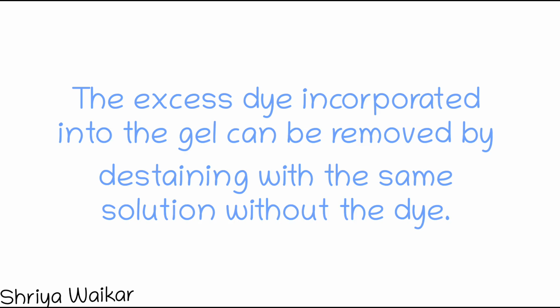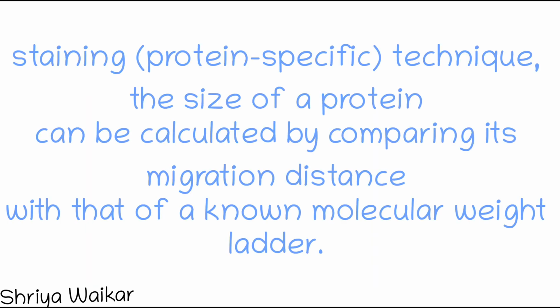After visualization by staining, or by a protein-specific technique, the size of the protein can be calculated by comparing its migration distance with that of the known molecular weight ladder.